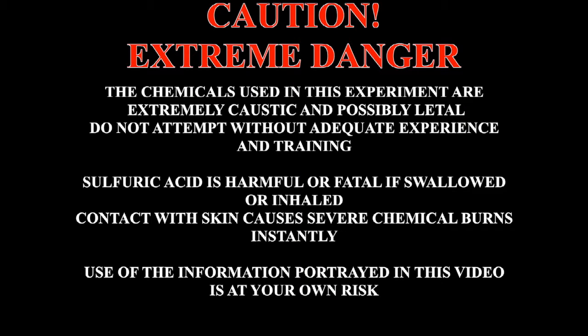Caution: extreme danger. The chemicals used in this experiment are extremely caustic and possibly lethal. Do not attempt without adequate experience and training. Sulfuric acid is harmful or fatal if swallowed or inhaled. Contact with skin causes severe chemical burns instantly. Use of the information portrayed in this video is at your own risk.